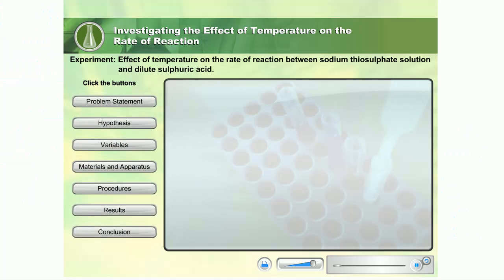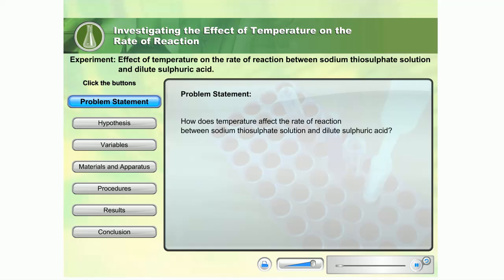Click on the Problem Statement button to start the experiment. How does temperature affect the rate of reaction between sodium thiosulfate solution and dilute sulfuric acid?